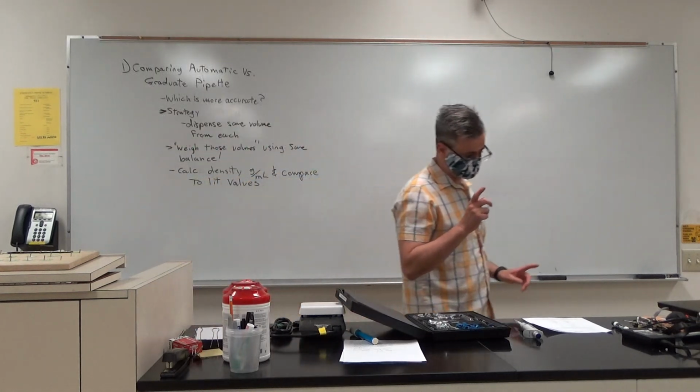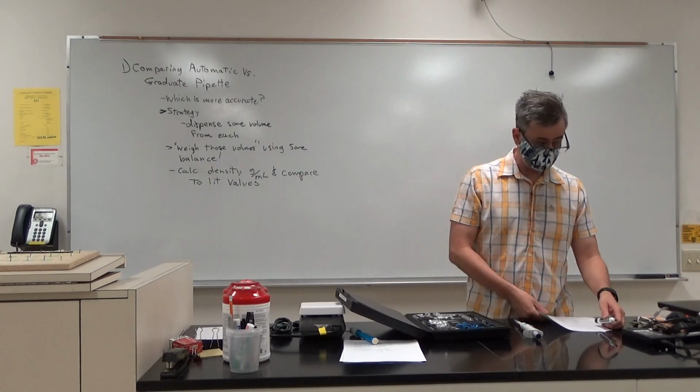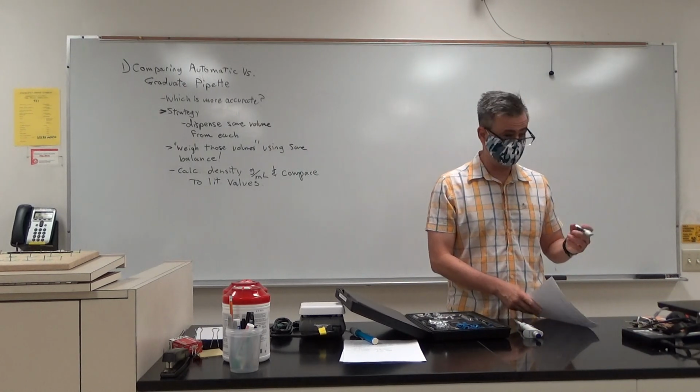I recommend that you use both, and you do it in the order or the way I'm going to show you here. That way, you'll have to do less weighing.